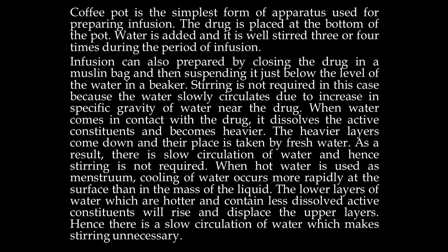So in the muslin bag method, we don't require any stirring, but we can make an efficient extraction. When the heavier layer comes down, its place is taken by the fresh menstruum.